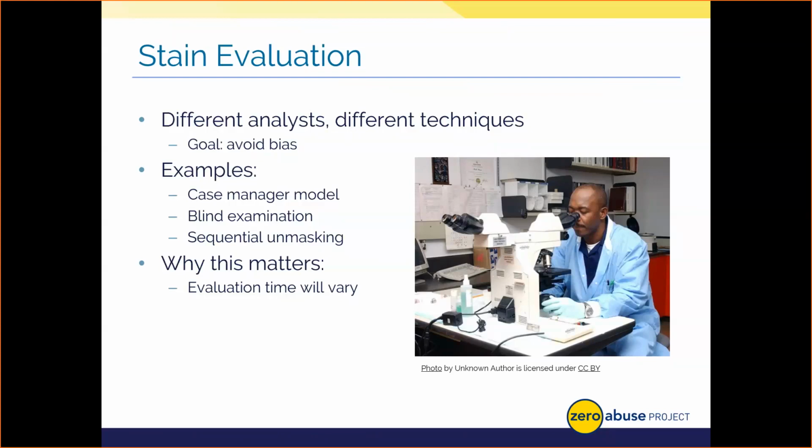This is where myself as the lab analyst might only look for evidence that would incriminate the suspect of interest for a case and avoid all known or detected alternative samples that refute this one or singular line of thinking. To avoid bias in our evidence processing that could lead to missed opportunities for discovering probative elements from an item, we use several different countermeasures when processing evidence.